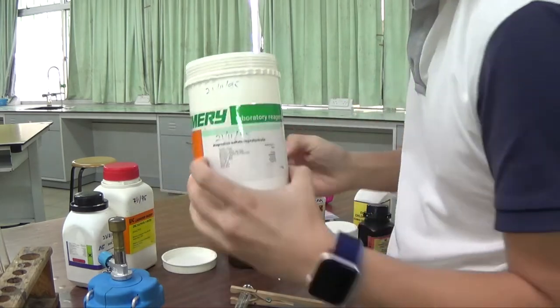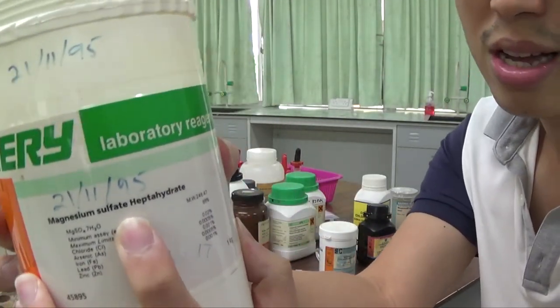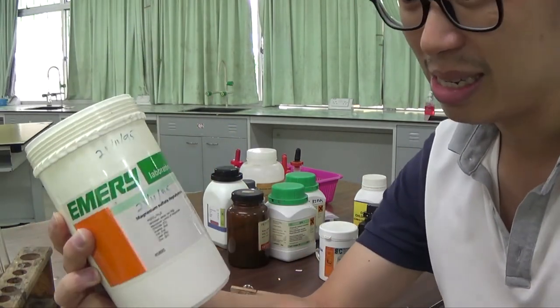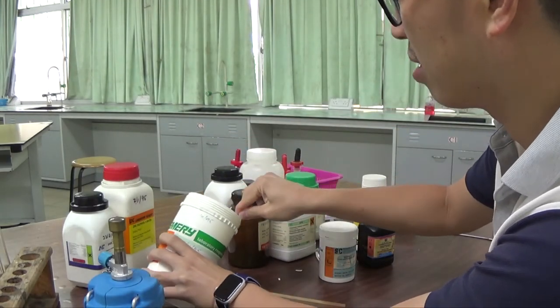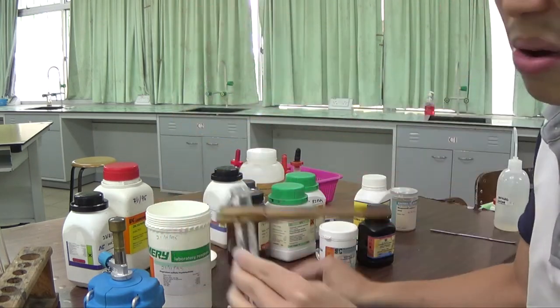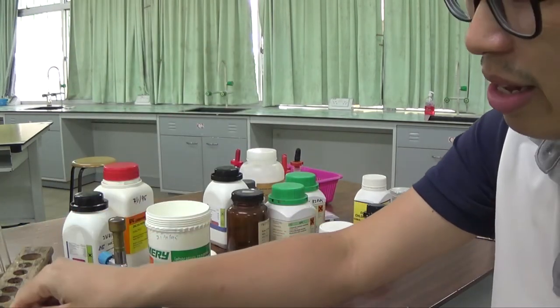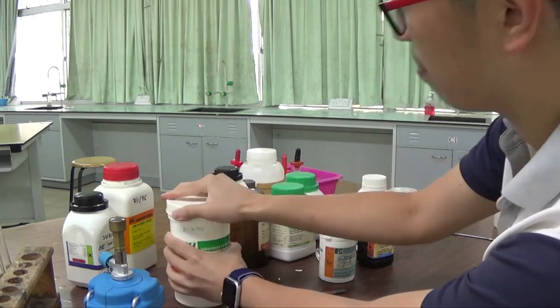I'm going to start out with this compound called magnesium sulfate heptahydrate. It does not matter because you're not supposed to know what the compound is. What matters is you're given this white solid. They will give it to you in a small vial. So I put a little bit of this. They will say, take a spatula of it in a test tube, heat it and then see what happens.